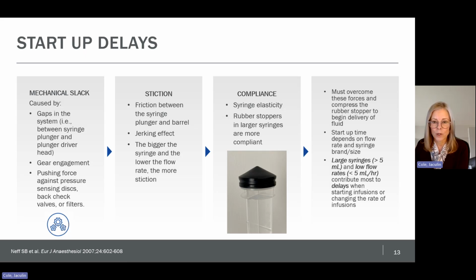And this is why it's important that the syringe is properly loaded in the syringe pump and that it's in contact with all areas of the pump that it should be. It can also take some time, as we mentioned, for those gears to be engaged at low rates and to begin smoothly turning. So priming from the pump can engage those gears quicker and decrease that mechanical slack. Also, when a pump is started, it initially has to push against any downstream pressures like pressure sensing discs, back check valves, or filters until that pressure is equalized.